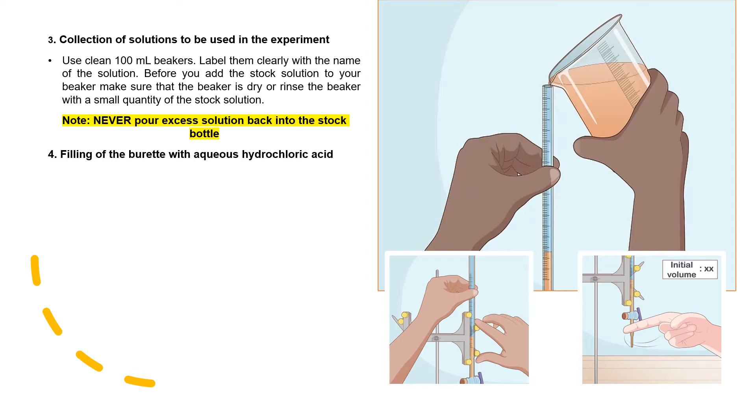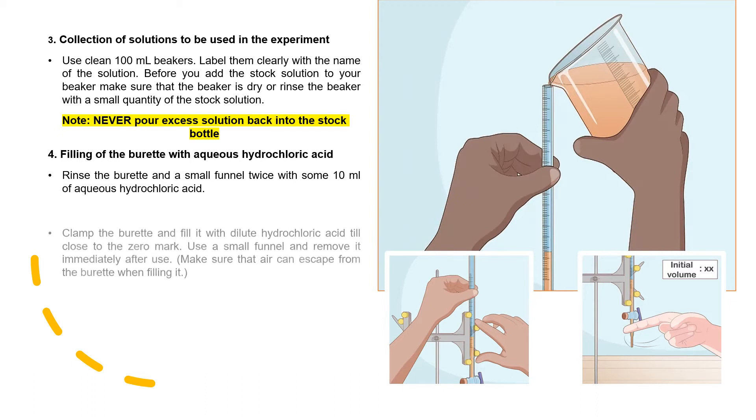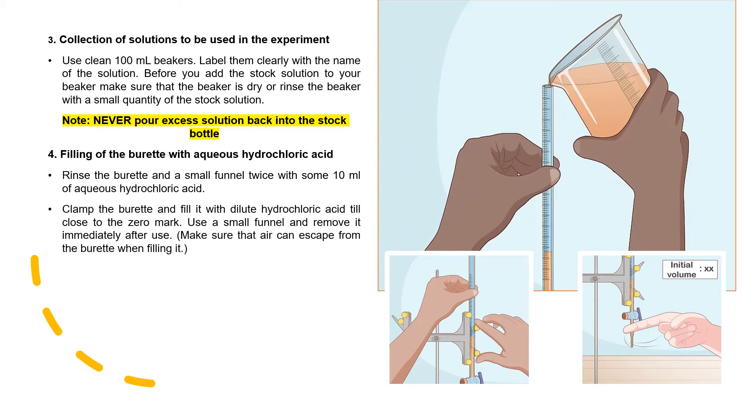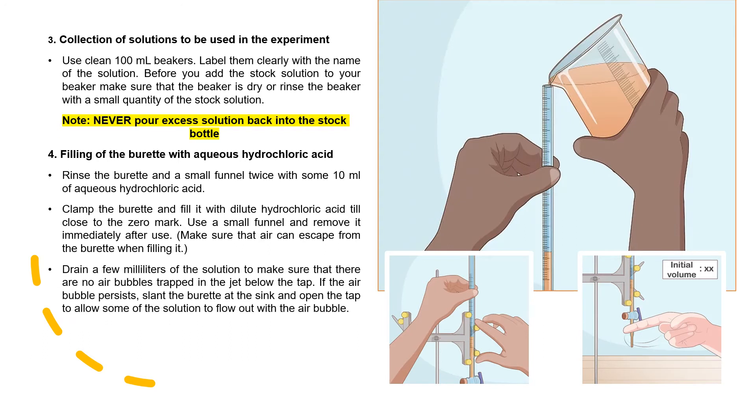Filling of the burette with aqueous hydrochloric acid. Rinse the burette and a small funnel twice with some 10 ml of aqueous hydrochloric acid. Clamp the burette and fill it with dilute hydrochloric acid till close to the zero mark. Use a small funnel and remove it immediately after use. Then drain a few milliliters of solution to make sure that there is no air bubble trapped in the jet below the tap. If the air bubble persists, slant the burette at the sink and open the tap to allow some of the solution to flow out with the air bubble. Then you must take the initial burette reading to 0.01 ml. To avoid parallax error, your eye should be level with bottom of the meniscus when you are taking the reading.